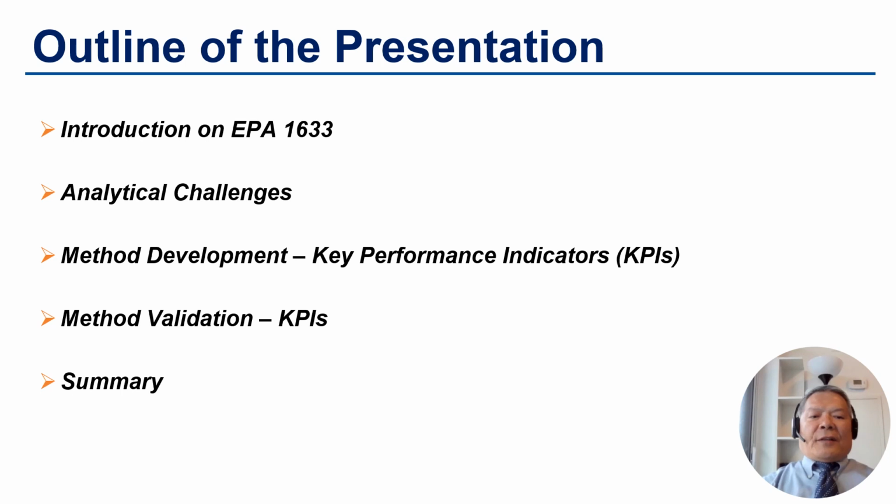In this presentation, I would like to address some of the analytical challenges for PFAS analysis, then discuss some requirements for method development, the key performance indicator, then discuss the key criteria for method validation. Finally, I'll show some results for the surface water analysis.